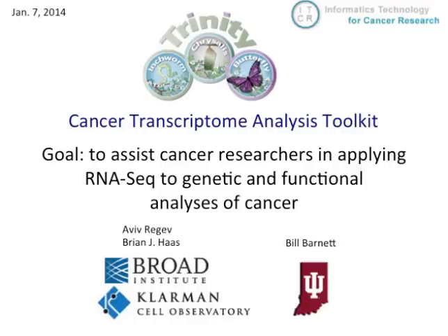Greetings everyone, and welcome to the screencast where we provide an overview of our project to develop and deploy a cancer transcriptome analysis toolkit, leveraging our Trinity software, with the goal of assisting researchers in applying RNA-Seq to genetic and functional analyses of cancer. This project is funded by the National Cancer Institute's Informatics Technology for Cancer Research and led by Aviv Regev and myself, Brian Haas, both of the Broad Institute and the Klarman Cell Observatory, and in collaboration with Bill Barnett at the Indiana University Supercomputing Center.